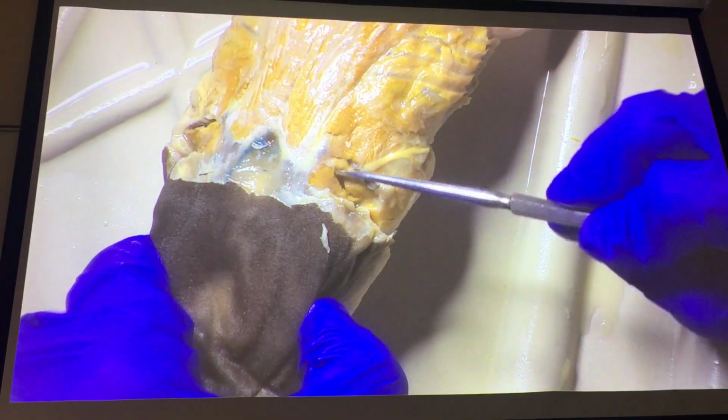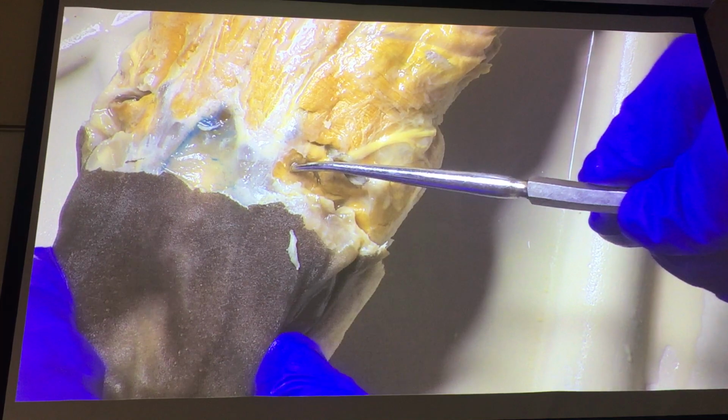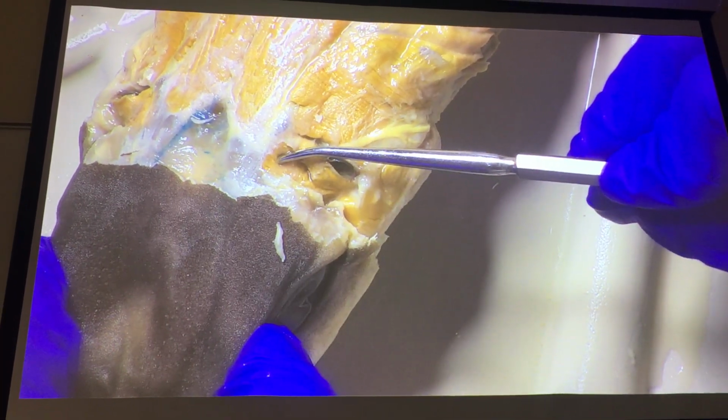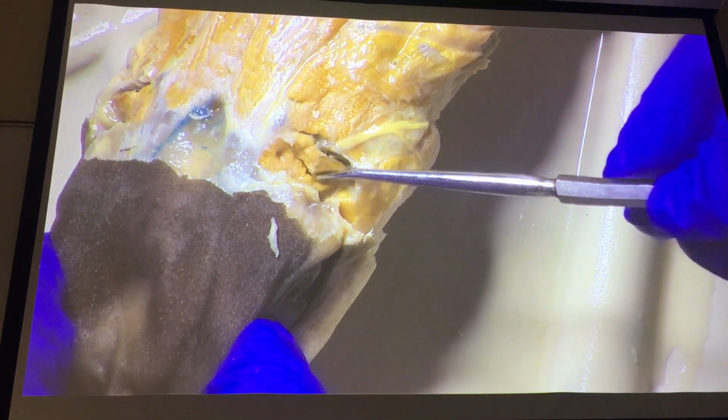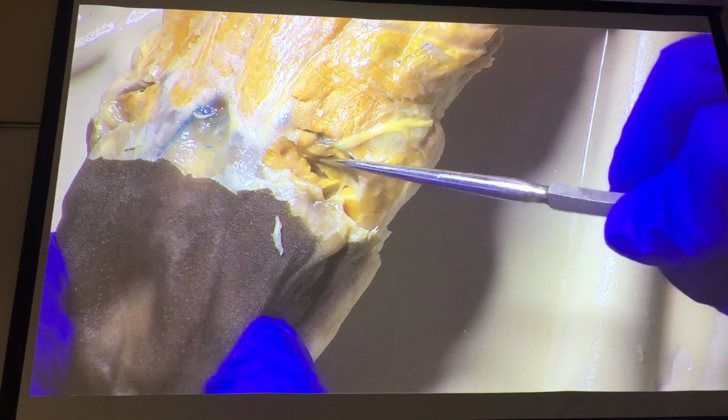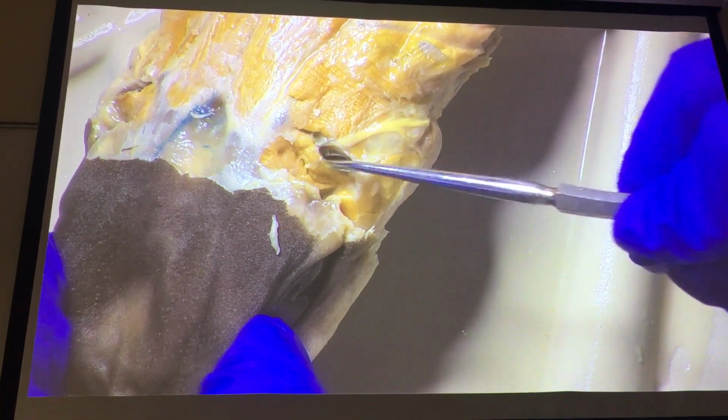We have our levator palatoquadrate, originating on the otic capsule, inserting on the palatoquadrate. Action is to raise the palatoquadrate or raise upper jaw. And here we have our spiracularis, which alters the size of the spiracle.